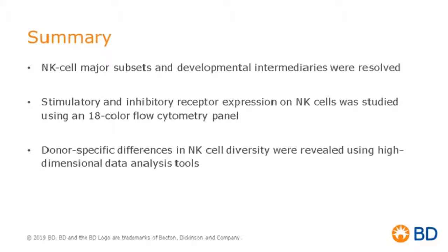So just to summarize what we've discussed in this webinar, we have showcased how multicolor flow cytometry can really allow you to resolve major NK cell subsets and different functional and developmental stages of NK cell maturation. We have taken different approaches to study the expression of stimulatory and inhibitory receptors. We have utilized first a modular approach with a 6-color backbone and then 6-color drop-ins to study either a stimulatory or inhibitory receptor.